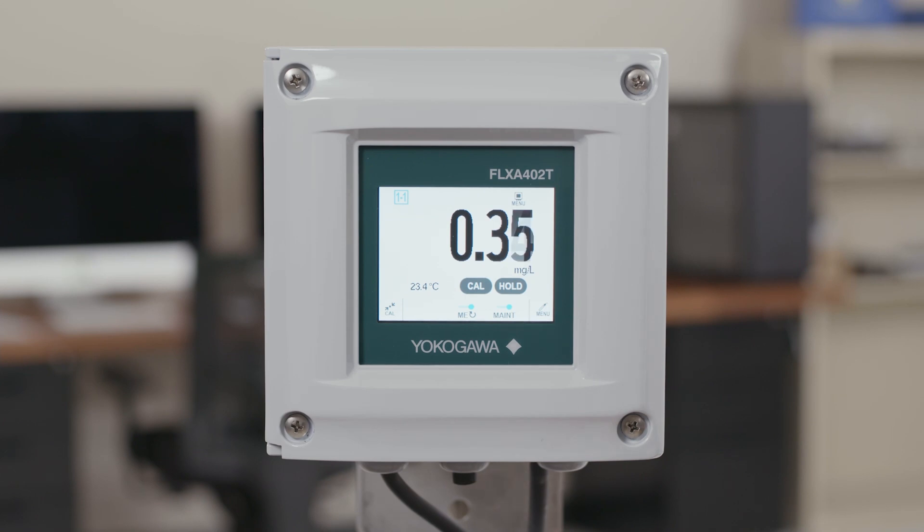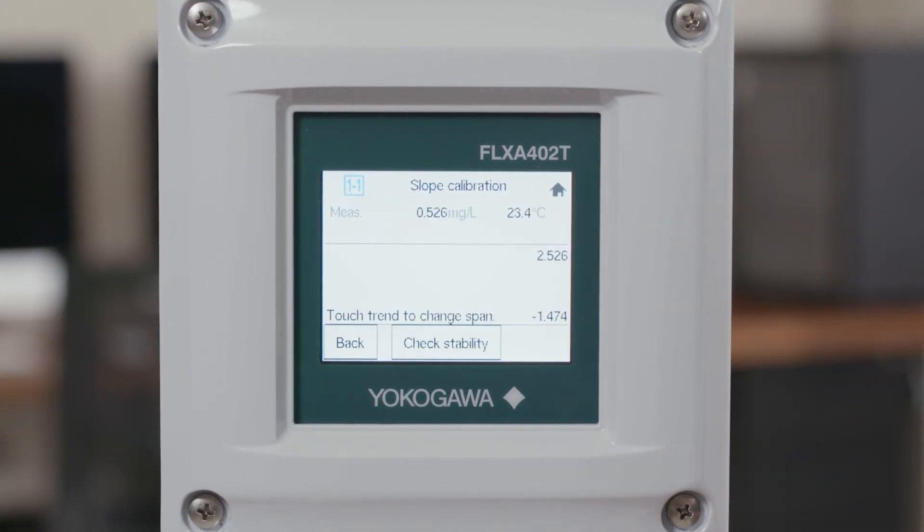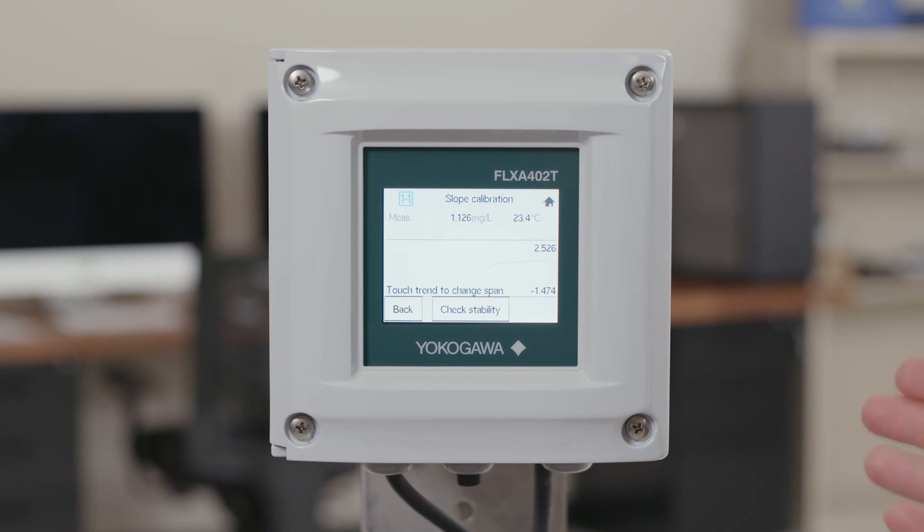Just like your zero calibration, you want to make sure that you're in maintenance mode and click the calibration button on the home screen. From here you will select slope calibration. Once you do this you'll see a familiar screen that will show your current measured value as well as a back and check stability button. As long as your reading is fairly stable, go ahead and click check stability.